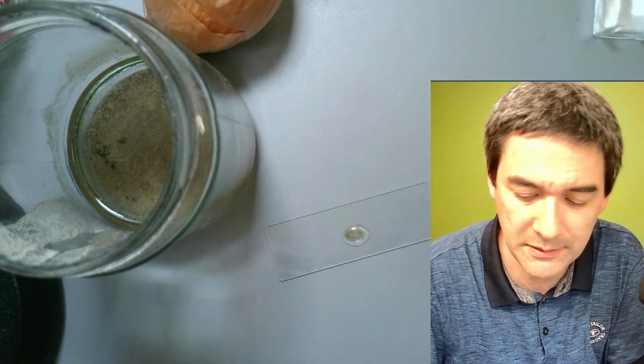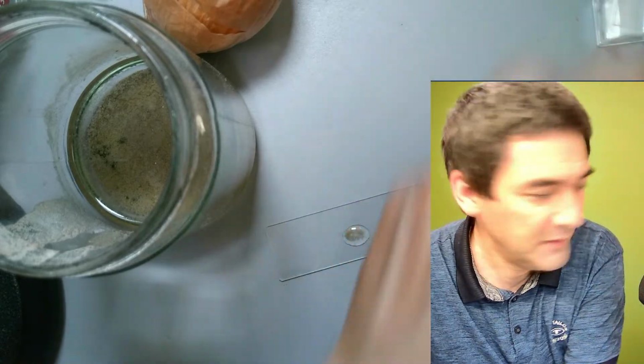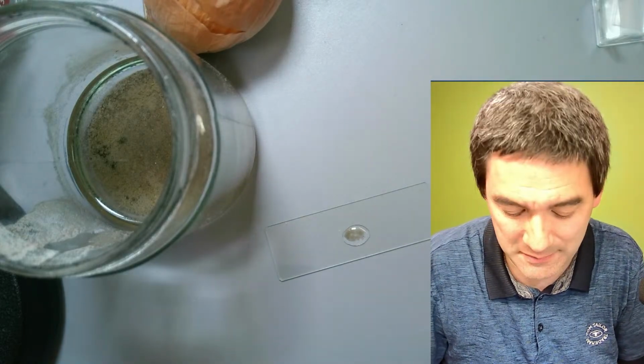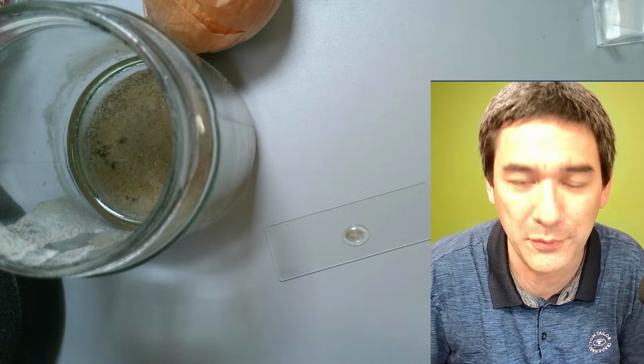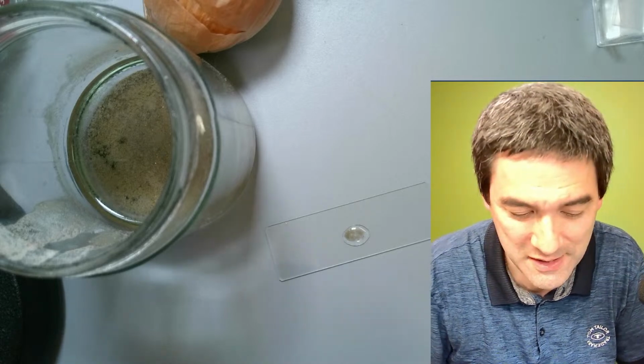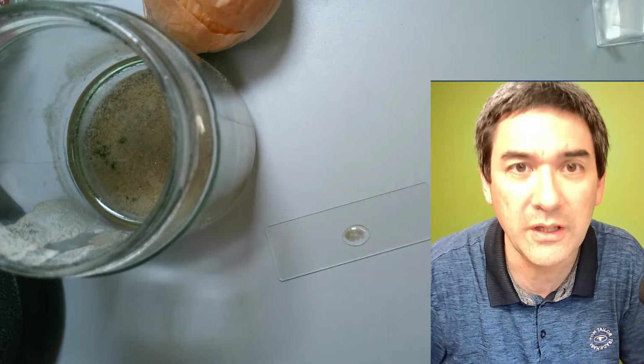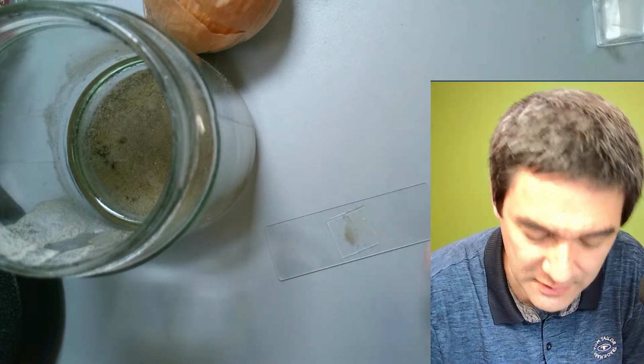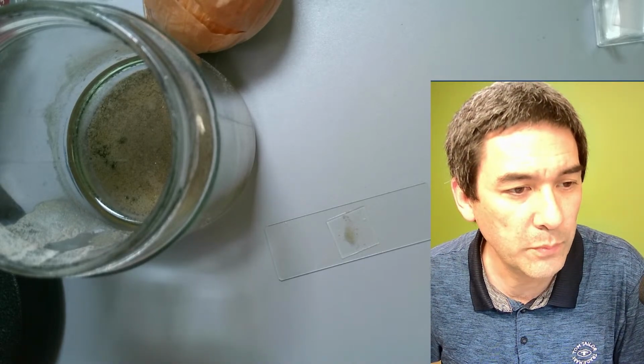This is one of the last things that I usually do with specimen samples before I throw them out, flush them down the toilet, so to say. But occasionally there are a few interesting things in here. You can see it's reasonably flat. Let's move over to the microscope view.